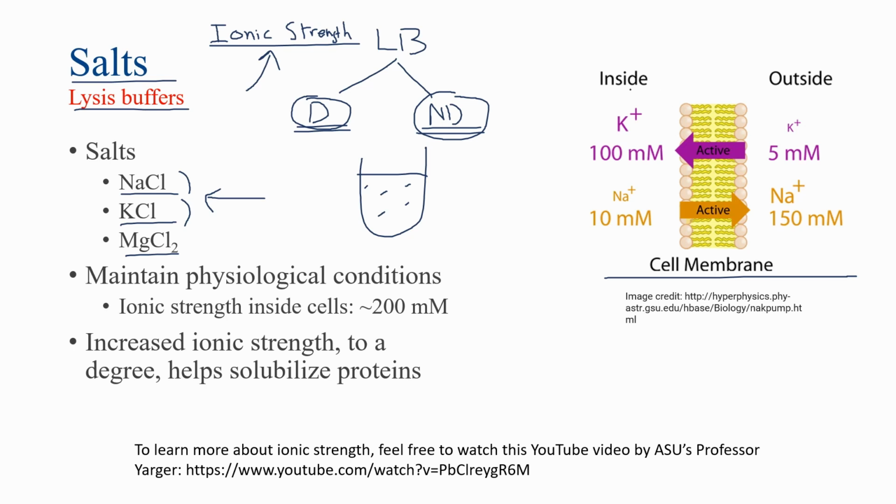So, for example, if we were to imagine that we have a cell membrane here, with the left side being the inside of the cell and the right side being the outside of the cell, we already know that there are important proteins that regulate ionic concentrations within the cell. And in turn, they also regulate the presence of these ionic concentrations outside the cell relative to the inside. So if we were to extend this cellular membrane like this, we can draw some of the important proteins that help regulate ion concentrations across the cell membrane.